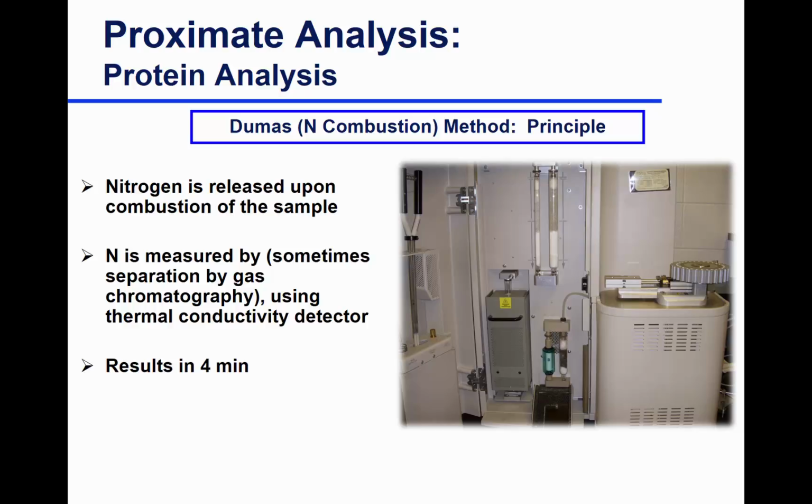Granted, as a reminder, you guys didn't see it. I'd already done it for you. I did have to calibrate it this morning, and that did take about an hour and a half to 2 hours to calibrate. So that calibration step is something that, if the instrument's not running well, can take a little while. But once you've got it running, your throughput is a lot of samples.